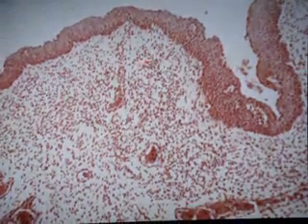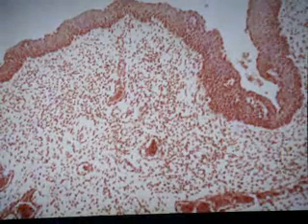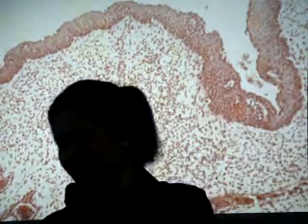Ano yan? Ito ang vagina actually. Okay? I cannot see the fibers, di ba? Kasi supposedly this is, the connective tissue here is made up of dense, irregular connective tissue. Pero pangit yung staining, kaya hindi ko makita yung fibers. But it is highly vascular, di ba? Yan, no? Daming blood vessels. And there are no glands, no? So, classify pointed tissue, dense, irregular connective tissue. Classify pointed tissue, stratified squamous epithelium, wet type, or non-keratinizing. Okay.